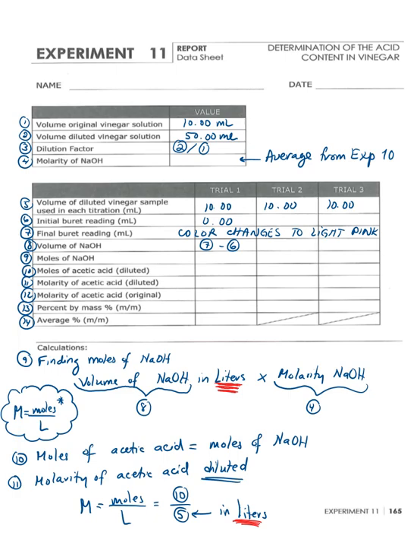So for the calculations here, you have your volume of original vinegar in solution. That's when you were pipetting 10 milliliters of your vinegar from the fume hood, and you were diluting those 10 milliliters into your volumetric flask with a total volume of 50. So to find your dilution factor, you're doing your volume diluted, like the total volume that you're using for your dilution, divided by the volume that you're taking for your vinegar, and that will give you your dilution factor.